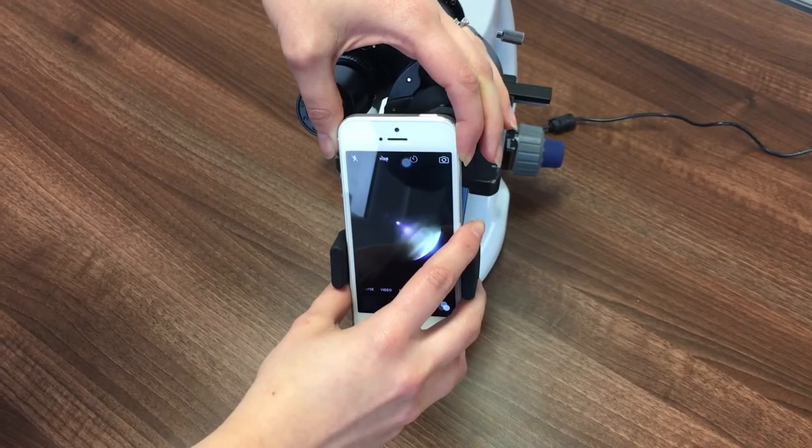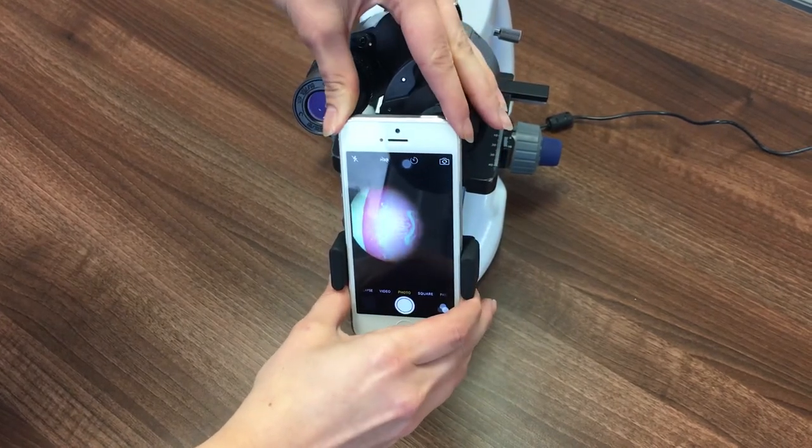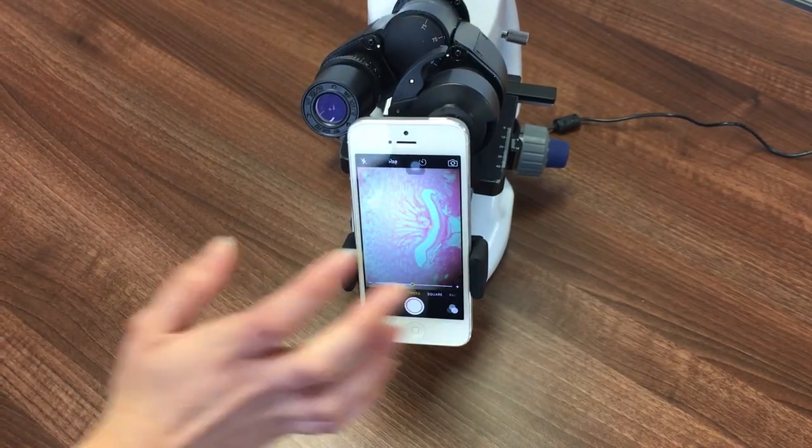Adjust the position of the phone so that the camera image is aligned with the microscope's light path. You may need to move the phone up and down and in and out of the grip, and adjust the adapter arm to achieve a suitable position.